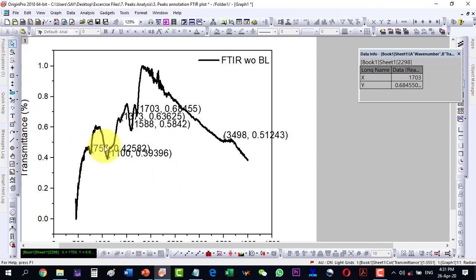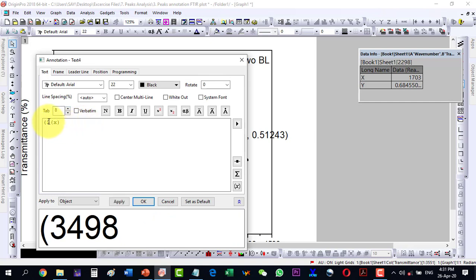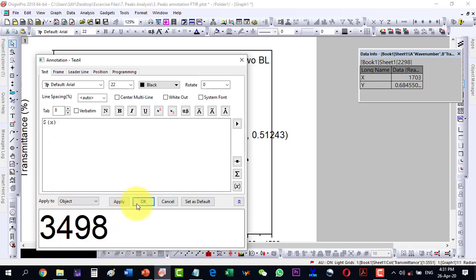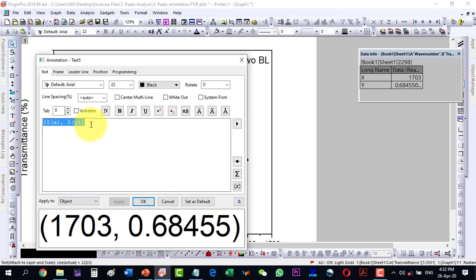Now I have found almost all the peaks. I can do some adjustments — the first thing I want is to keep only the x value and not the y value. Double-clicking the annotation, I see it has the dollar symbol and x and y in the legend. I remove the y part and the bracket, so now the value shows only the x. I click OK and do the same for all of them.